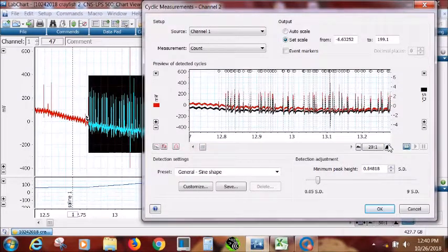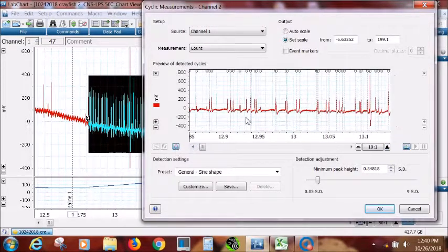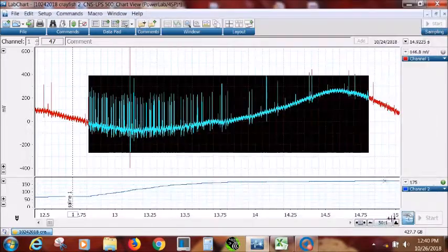If you want to spread it out, you can make sure again that you record everything. If we went this way, you could see that we've got all the events that we want. Okay, and that's our standard deviation. So I'm going to copy that because we're going to use that in a minute. I'm going to say OK.